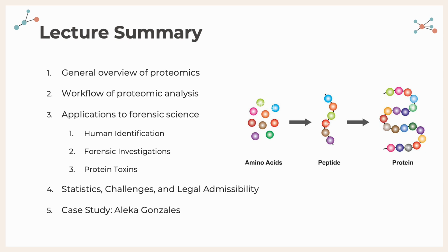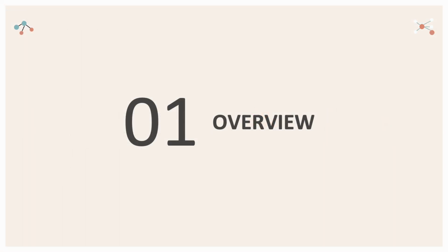This lecture series will cover the general overview of proteomics, how you would conduct a proteomic analysis, applications to forensic science, any challenges and logistics, and finally end off in a case study. To start off, let's go over the definition and what proteomics is.